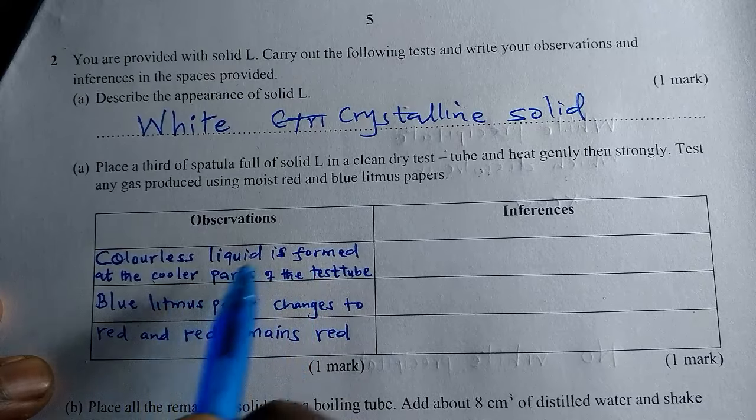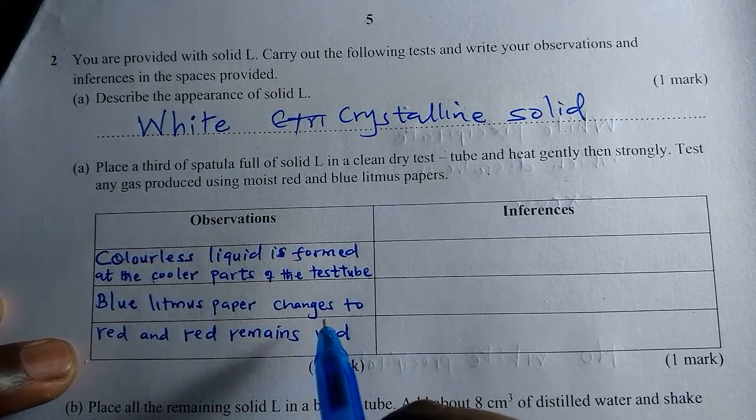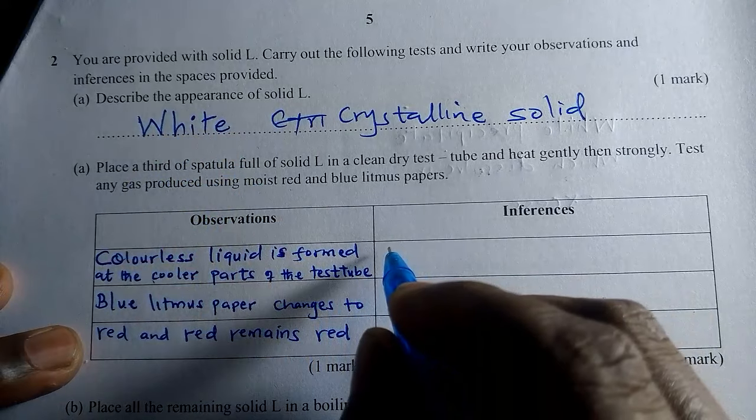So that if that is the case, then it means that this solid L is hydrated. In other words, it contains water of crystallization. So you will say solid L is hydrated.